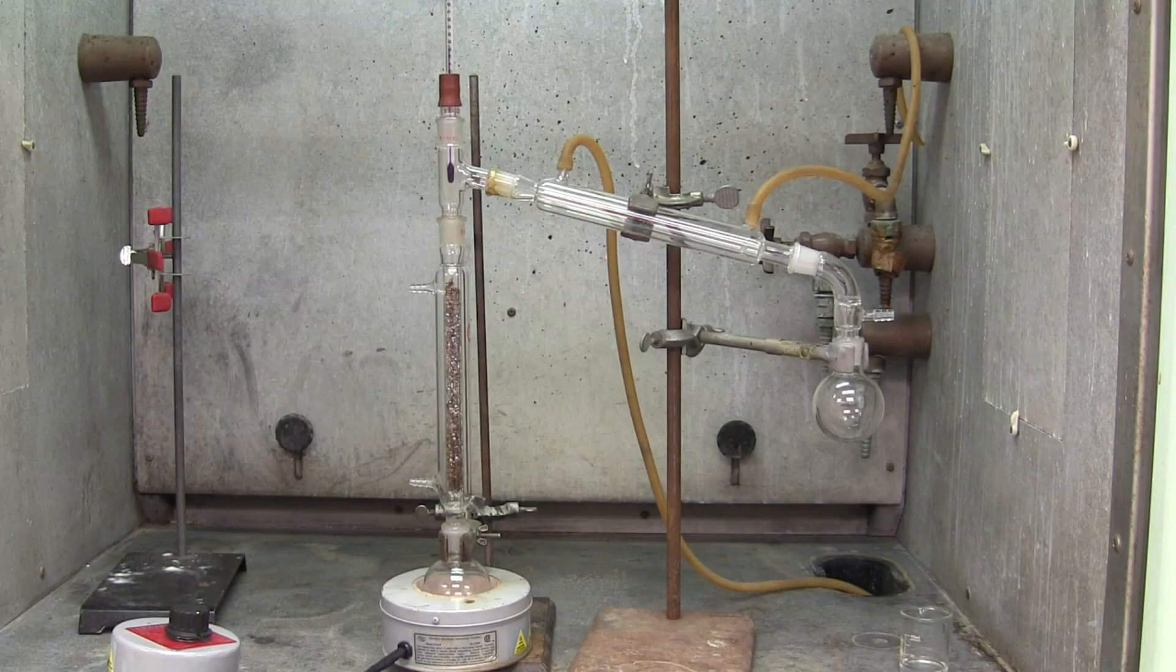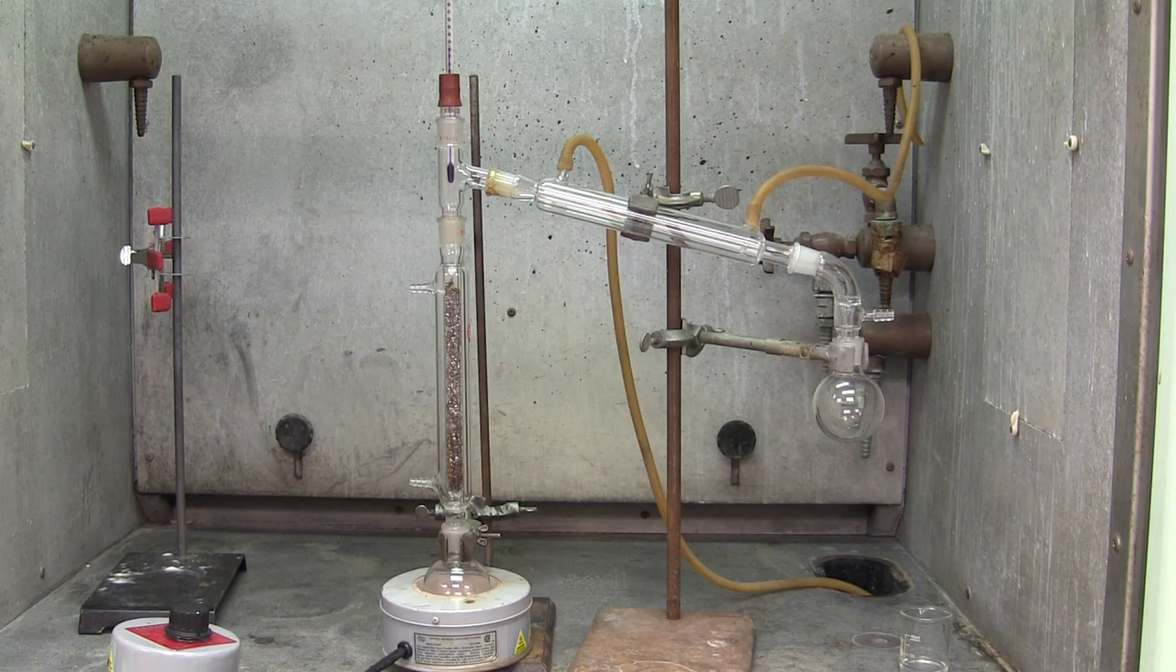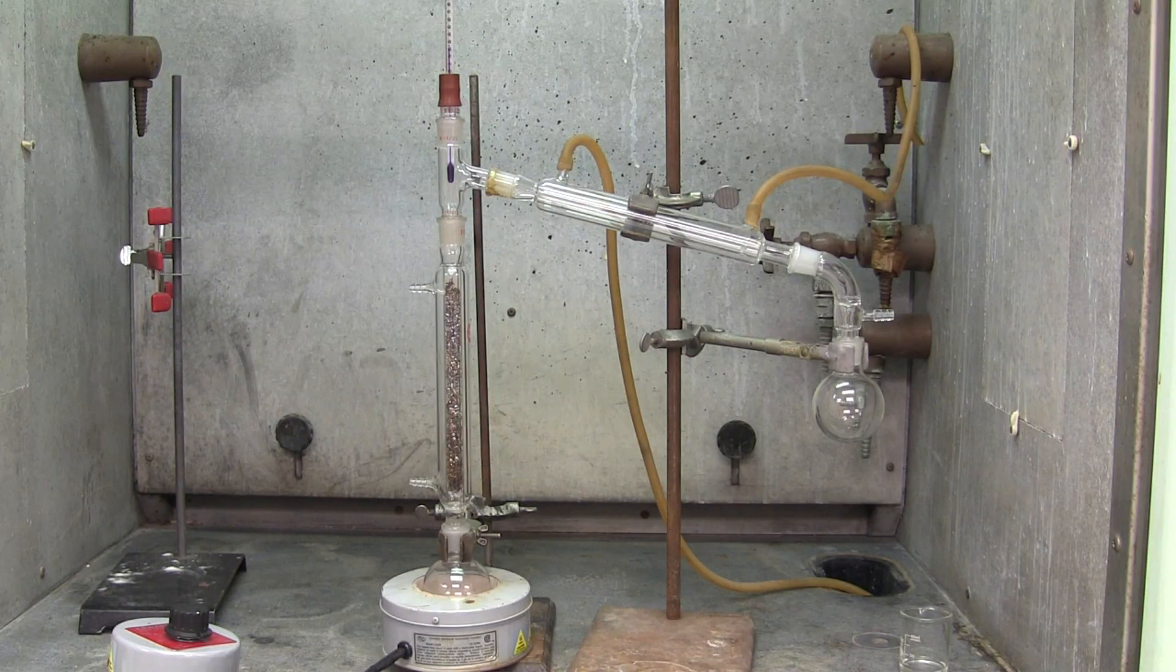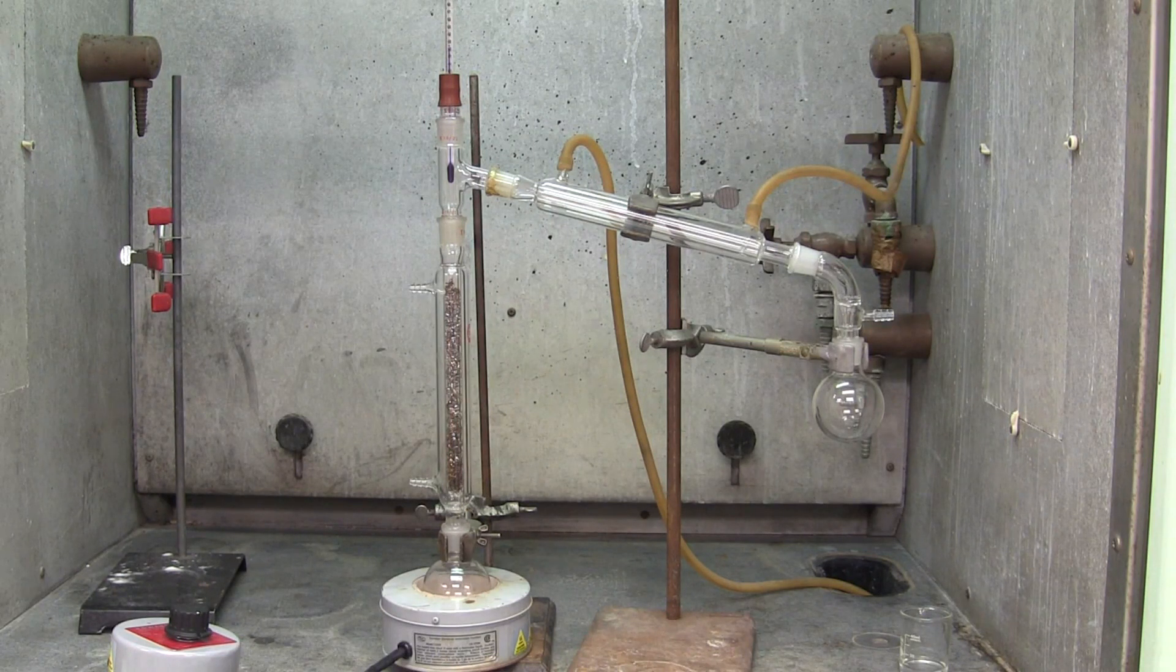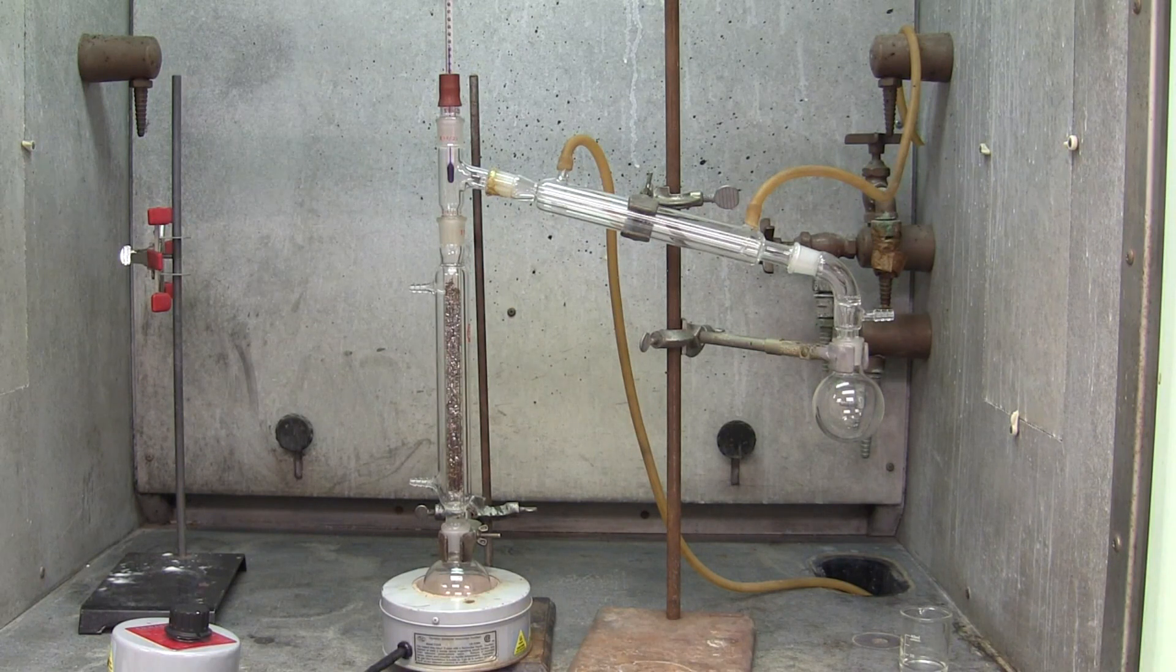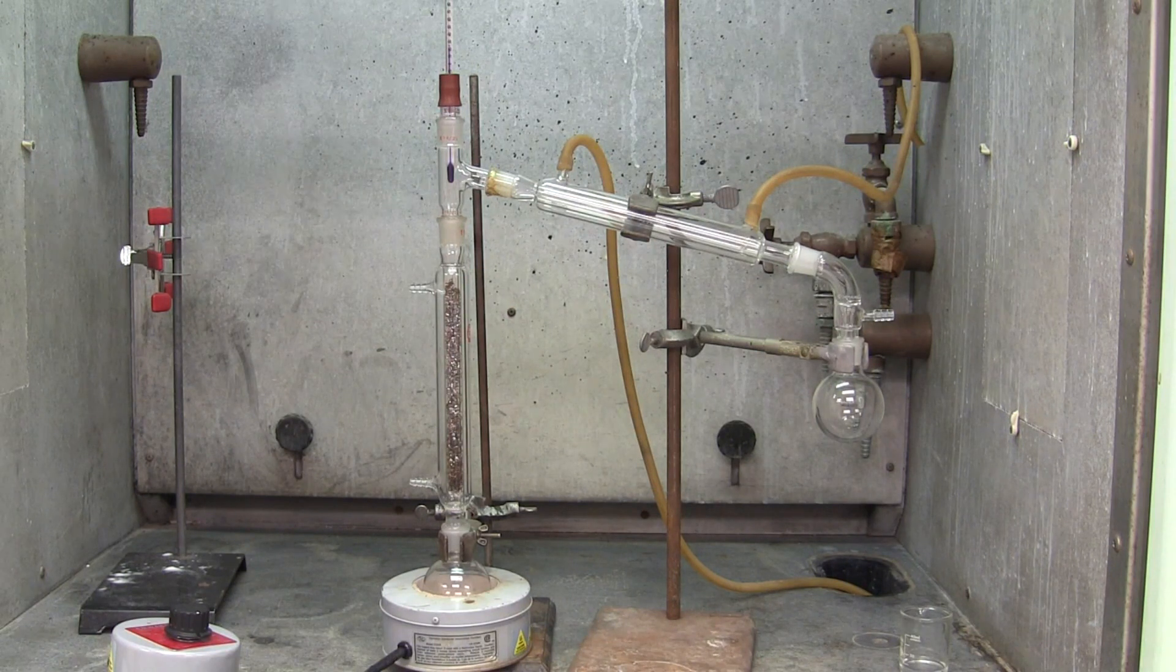In a fractional distillation, a fractionating column is added between the distillation head and the distilling flask. This method ensures that a liquid mixture with substances that have similar boiling points is separated efficiently.